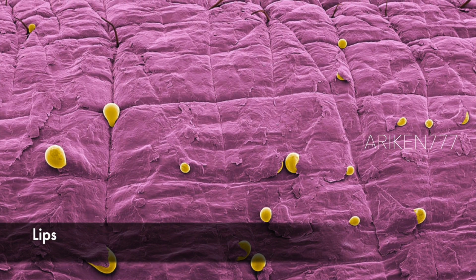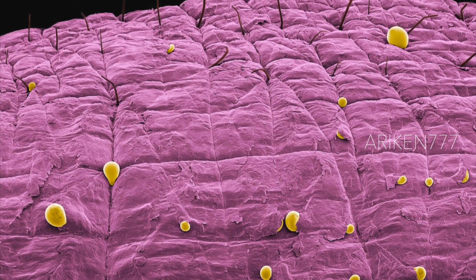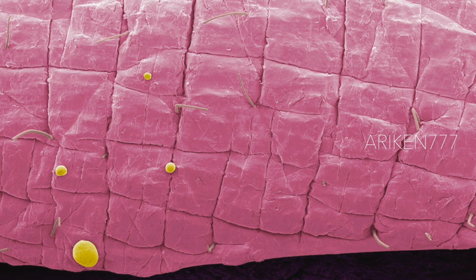Human lip skin. This view shows small hairs, the cracked lip surface, and sweat and oil droplets. The skin of the lip with 3 to 5 cellular layers is very thin compared to typical face skin, which has up to 16 layers. With light skin color, the lip skin contains fewer melanocytes. Because of this, the blood vessels appear through the skin of the lips, which leads to their notable red coloring.